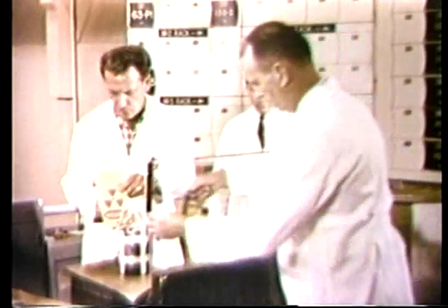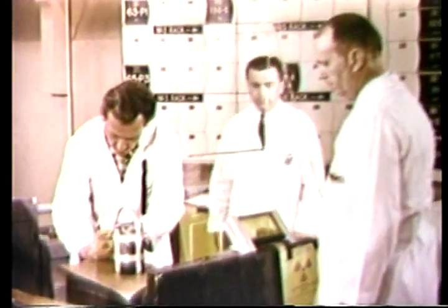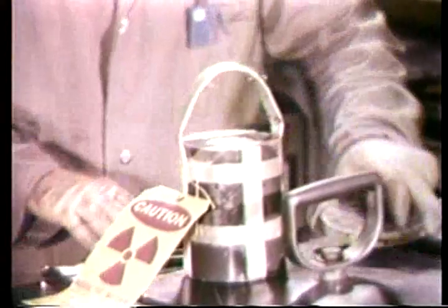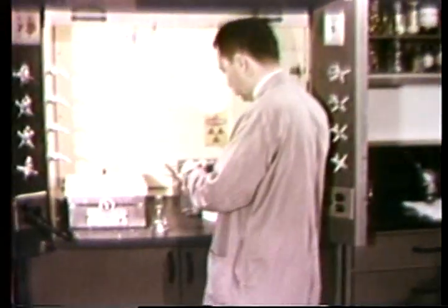Before the lead container can be transported back to the FBI laboratory, it must bear a radioactive material label which states the radiation intensity at its surface. Here, in the neutron activation analysis unit, the samples are unpacked. Before the examiner can measure any arsenic which may be present, it must first be isolated from other radioactive constituents of the bone.